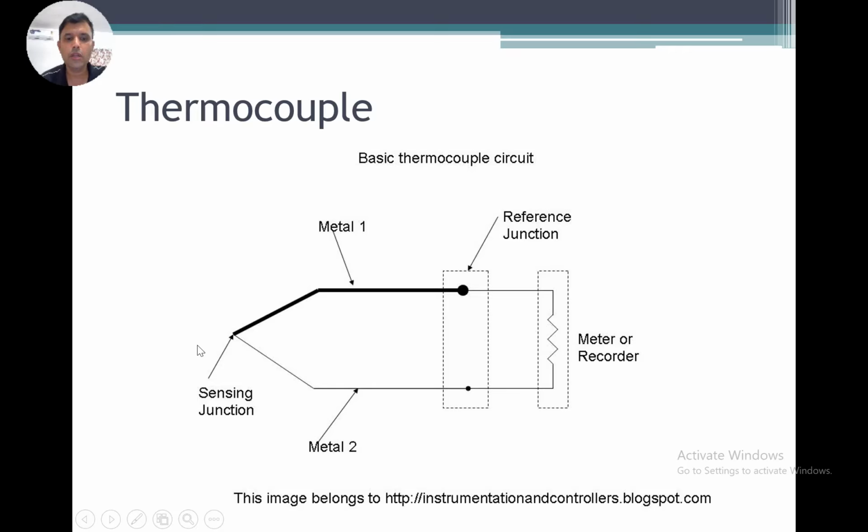That means between the hot junction and the cold junction. This temperature difference generates a small voltage according to the Seebeck effect, and the magnitude of this voltage is proportional to the amount of radiation falling on the detector. Since the voltage is very small, it is usually amplified before being recorded as an electric signal. This signal can be used to produce the IR spectrum that reflects the absorption characteristics of the sample.